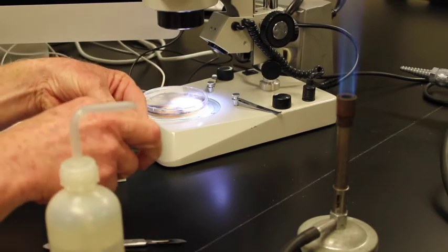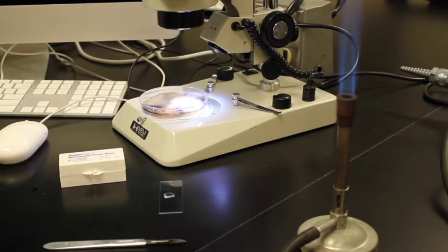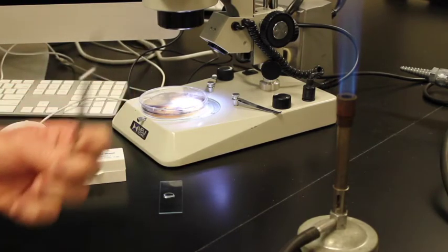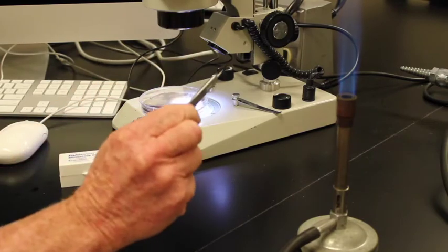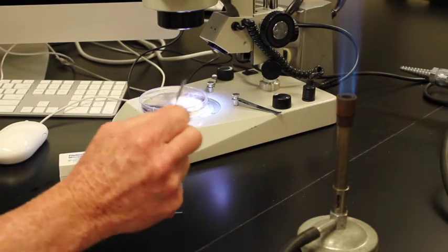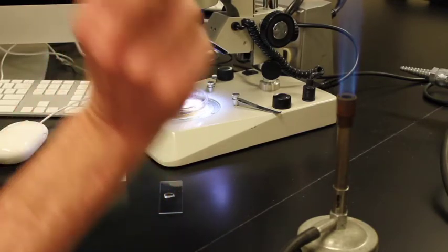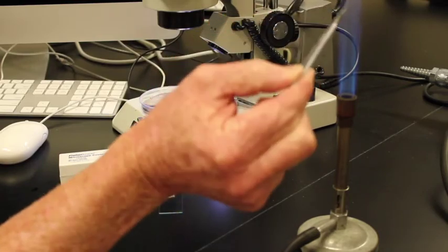Okay, so I have a little bit of water on the microscope slide. Move the water bottle. Now I have a Bunsen burner going. Anytime you work with bacteria or with microorganisms, you want to make sure you use a sterile technique, so in this case, the fungus doesn't get infected by other fungi or bacteria. So I'm going to flame my loop.